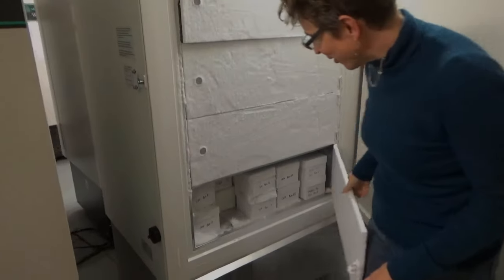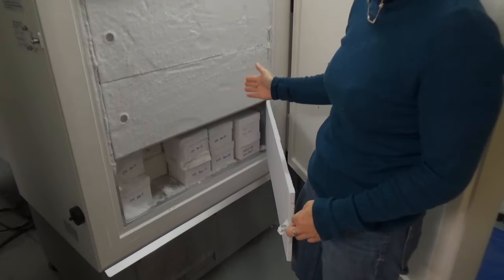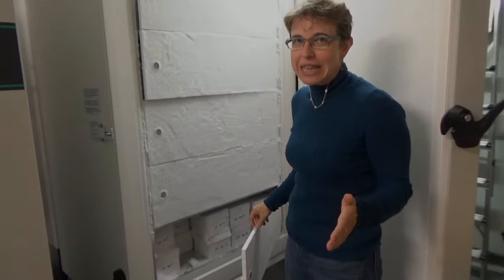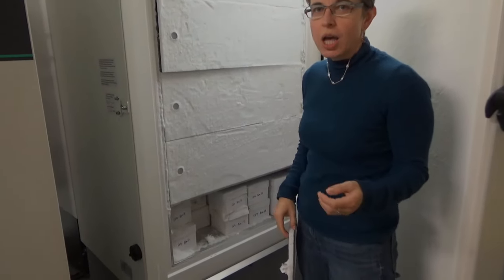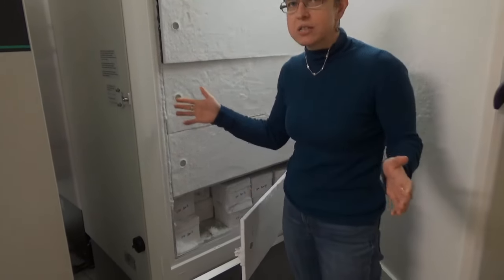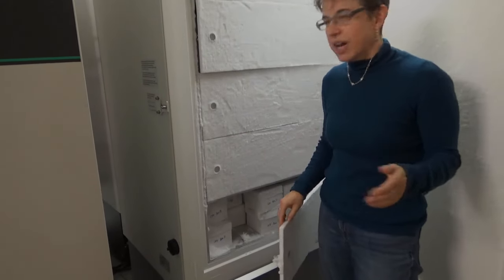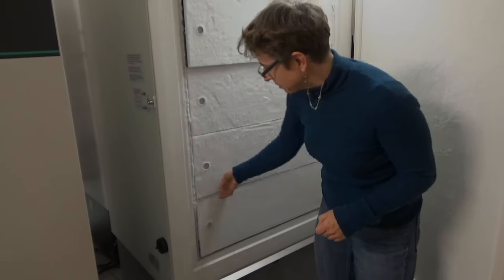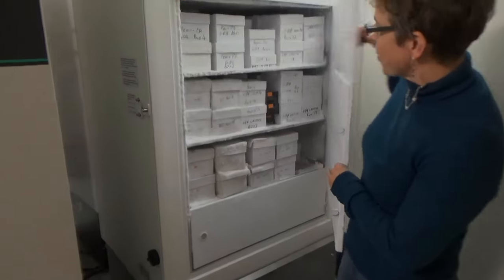This is where we store the samples, so they're all organized in rows and boxes so that we can find them easily, and everything is logged into a database where we have the history of all the samples, when they are collected, and what has been done with them, and who we are transferring them to. So that's what it looks like.